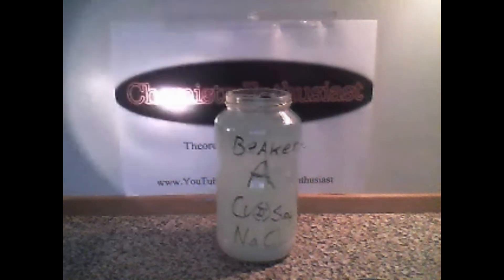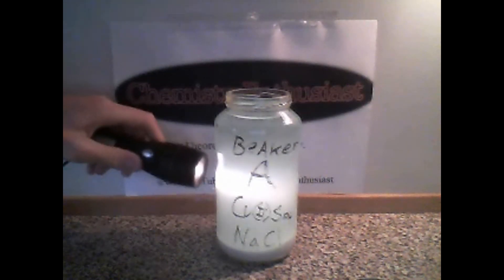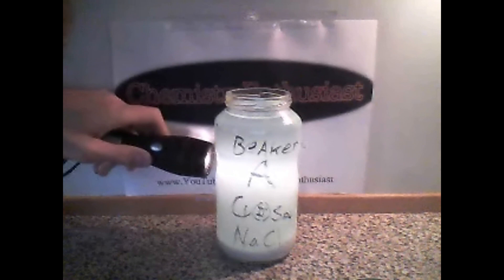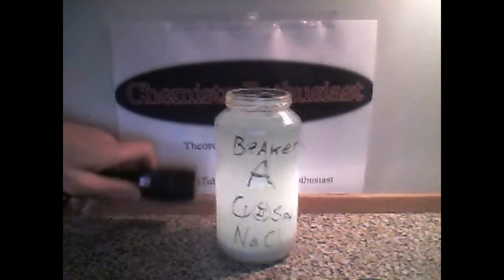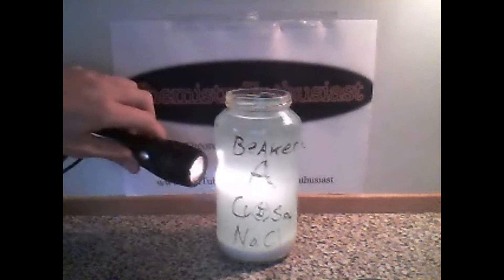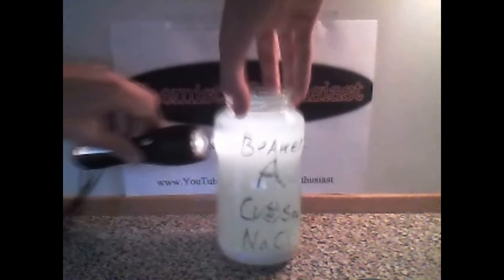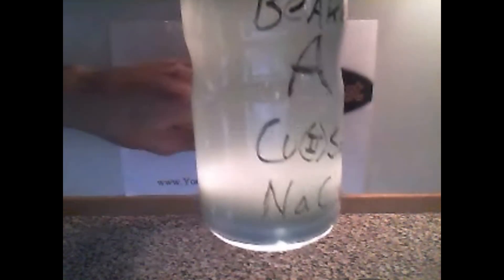Now wait another 5 minutes. After the 5 minutes, the copper chloride will have collected at the bottom. As you can see here, there's almost no particles left in the water, and all of the particles have ended at the bottom of the beaker. Now that's good. You can see with the flashlight that there aren't that many particles left, but I am impatient so I am going to move on now.